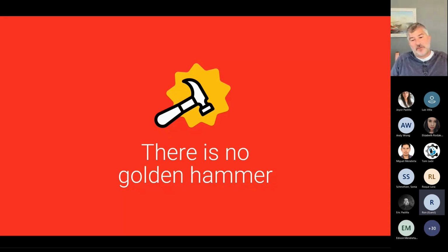A key feature of all of this approach is ensuring that every section is able to be upgraded and migrated forward, and not just stuck and stagnant. As soon as something becomes stuck and stagnant and you can't upgrade it, it will hold your lab and process behind because no one will dare spend the money. If you can continually be upgrading the different sections independent of each other, it's much easier to keep up to date with new functionality and features that become available in the industry.